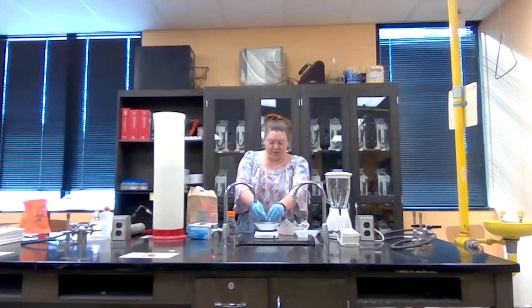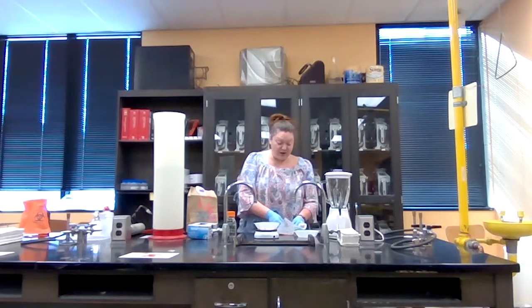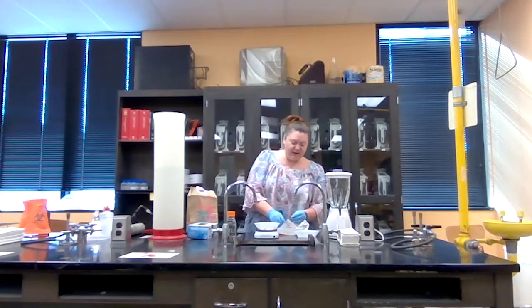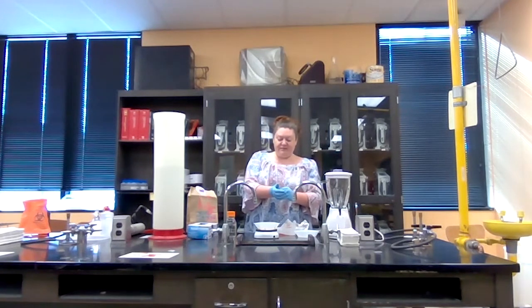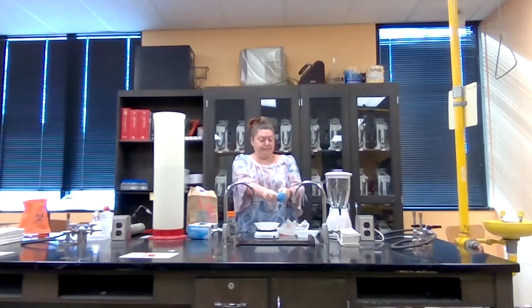Then I'll just keep going back and forth and all around to try to get equal parts of all of these things that are in here until I get 20 grams of taco weighed up. Right now I'm at 17.7 grams. I'm going to go back to the meat, I think. All right. And we have 20 grams. All right. So now these are all gooey. Take these off. There we go.